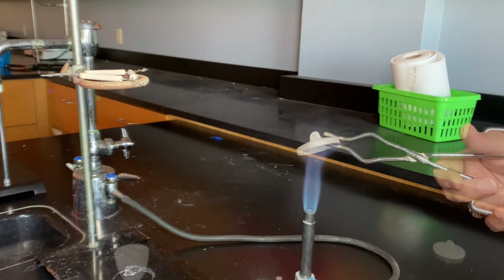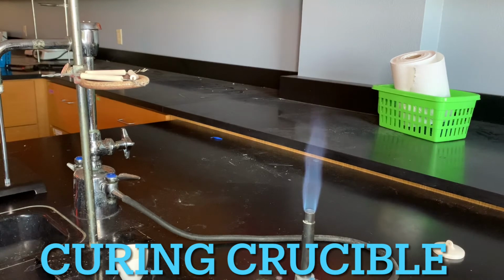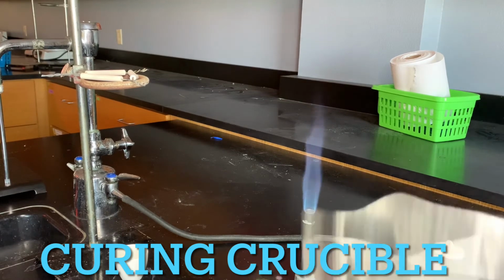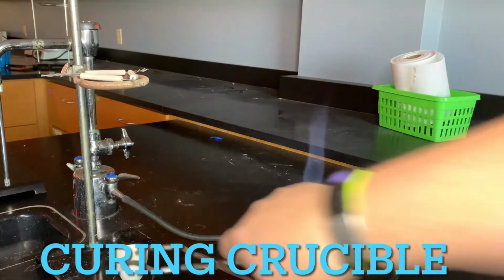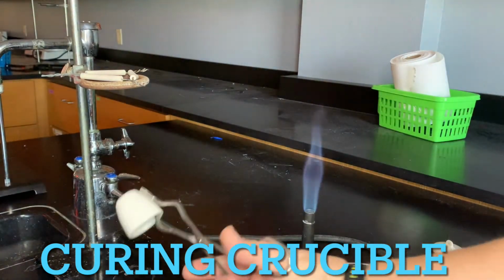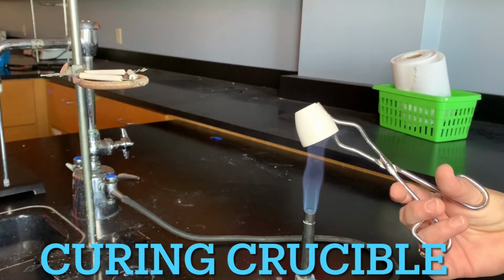We're going to heat that. So to clean our crucible, we're going to use heat. It may look clean to you, but you need to go ahead and make sure we do this step. So you're going to take your crucible tongs, grab your crucible like so, and just stick it over the fire.